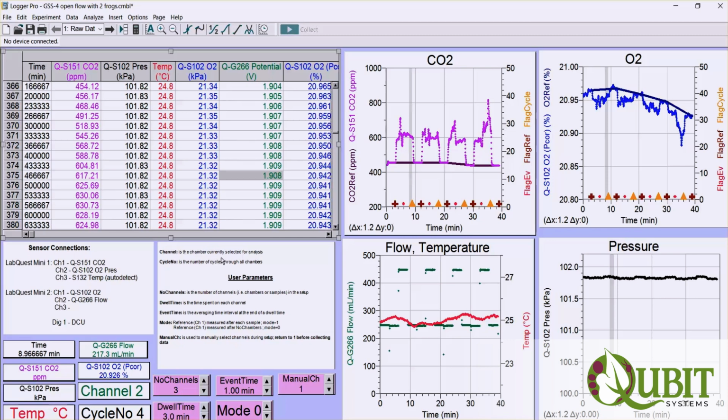So basically restart your experiment every day so you don't end up with one big experimental file with a lot of data, which is more cumbersome to manipulate. And also, in case something happens, like a power outage and the computer goes down, you're not losing all the data. It's a way to make sure that your data is backed up and saved.